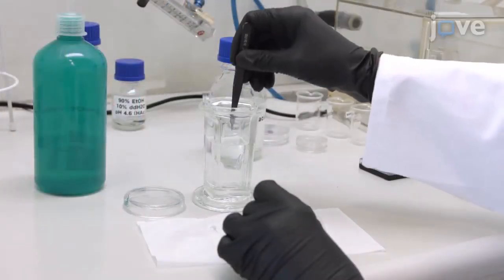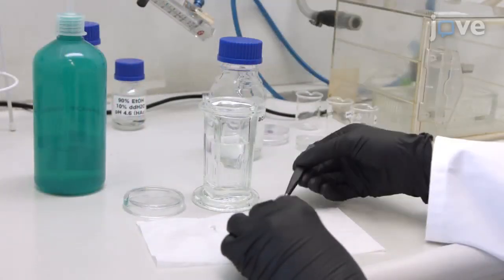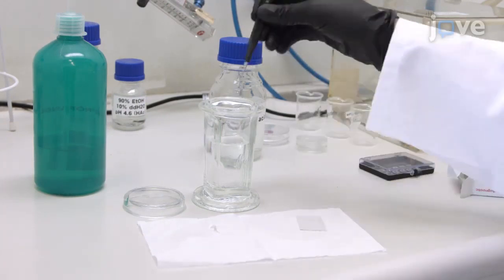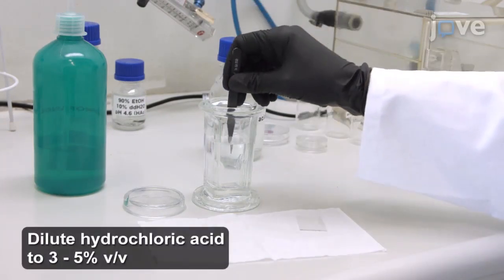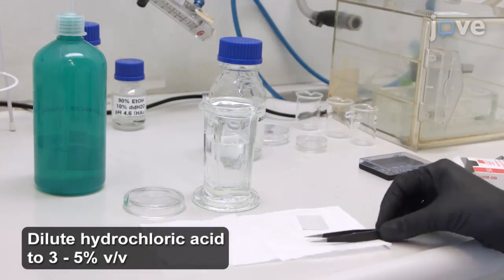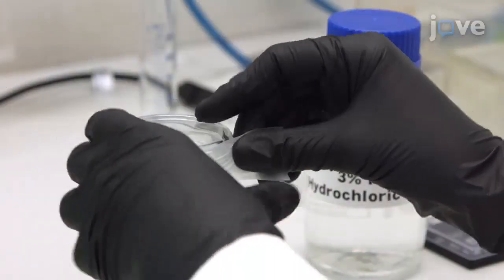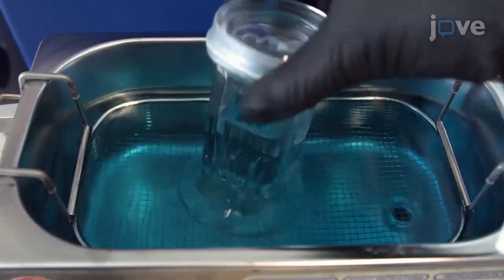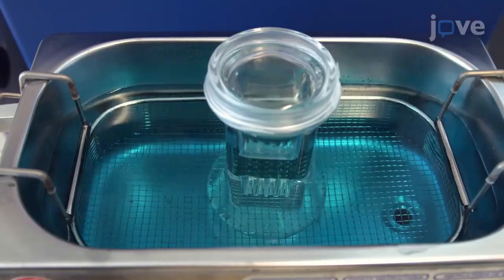Transfer the cleaned slides to a staining jar filled with hydrochloric acid diluted with doubly distilled water. Seal the jar with an appropriate lid and place it in an ultrasonic bath for 90 minutes at room temperature.